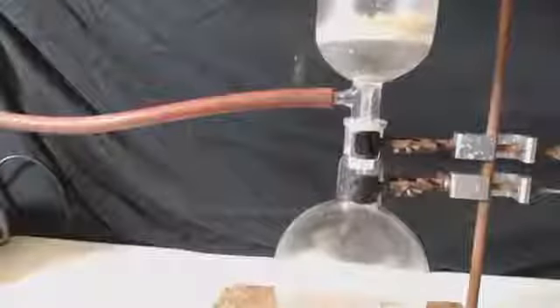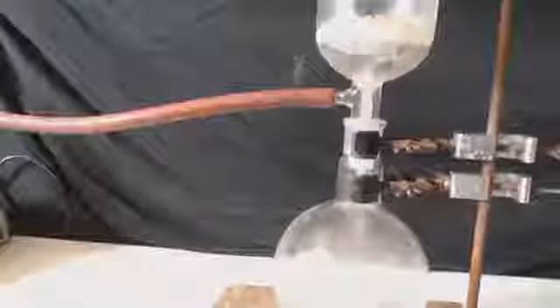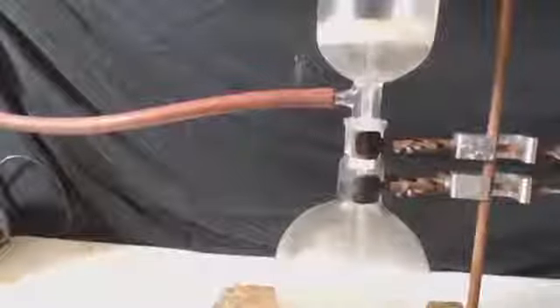Here's after about 2 or 3 days. I put it in a bigger pan so it'd be nice and shallow. You can see lots better, looks better than crystals. I'm going to filter this and wash it up with some cold water. Well, there you go. I got 29 grams of nice clean crystals after one crystallization.